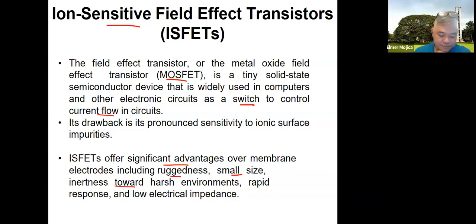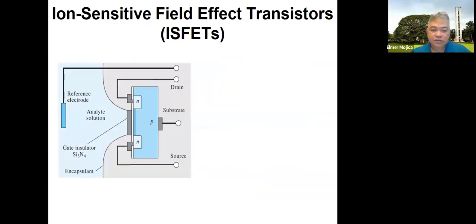Okay. And I think one example that they have here is an ISFET. What do you think this measures? Anyone? What ion do you think it measures? pH ion.